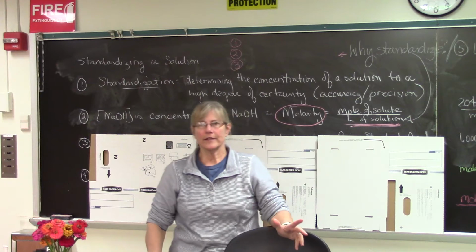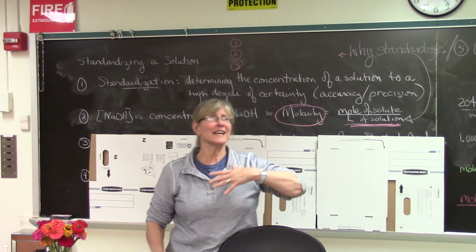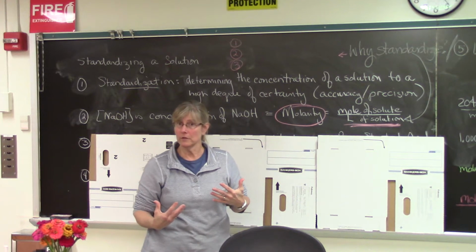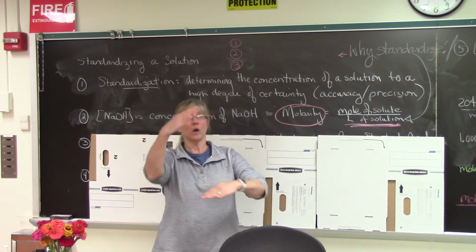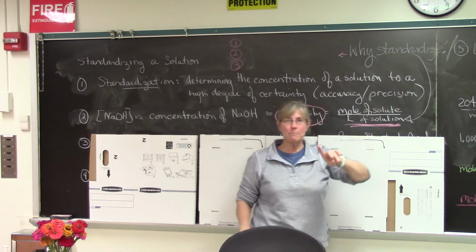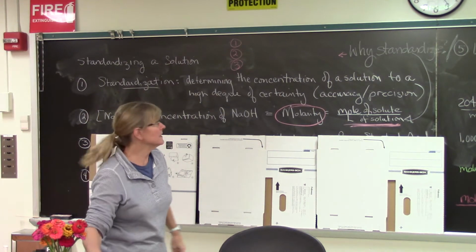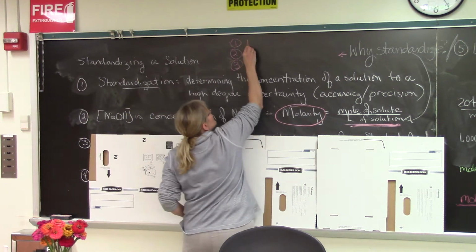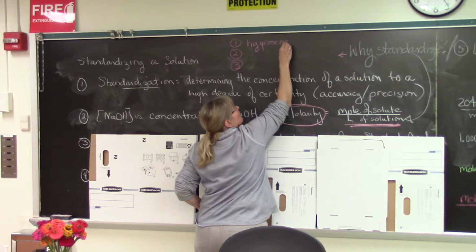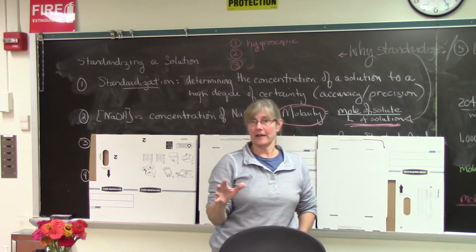So what's the point of standardizing anyway? I mean, if I'm going to sit down and make sodium hydroxide solution, why can't I just find some grams of it, convert it to moles, and then put it in a certain amount of water to make 1 liter? Why wouldn't that work? Well, we need to standardize many, many substances for 3 reasons. One of those reasons is that the substance can be very, what we call, hygroscopic. Hygroscopic, which means it absorbs water super, super fast.